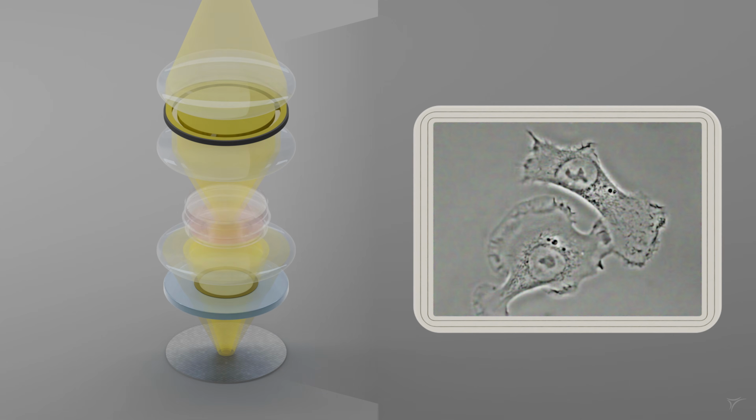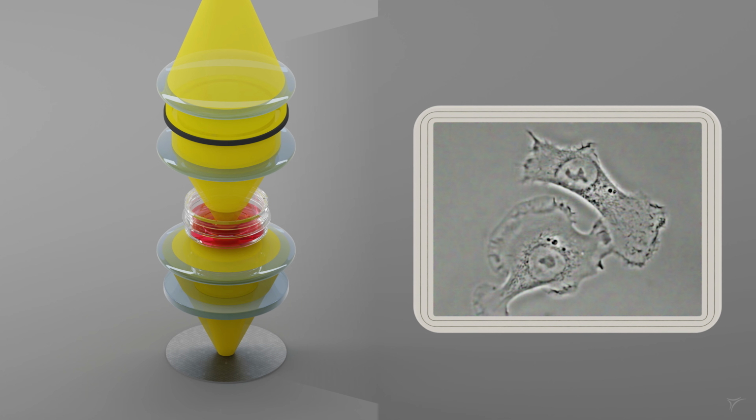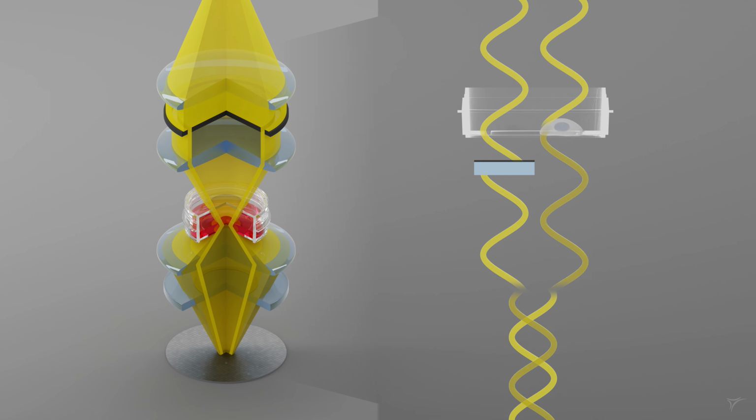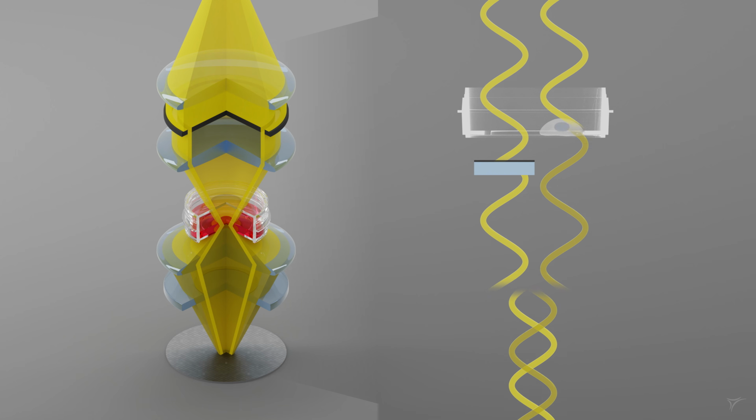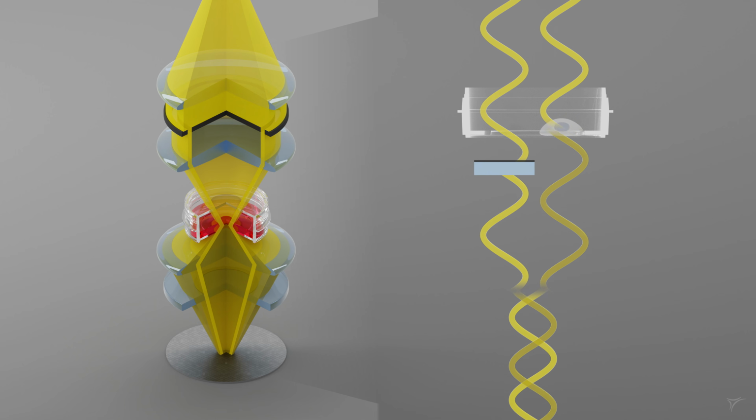Therefore, it is crucial that the annular ring and the phase ring are well matched and precisely aligned to achieve maximum contrast. So, the basic principle of a phase contrast microscope is transforming a phase shift into an intensity shift to create a good contrast of non-pigmented cells.